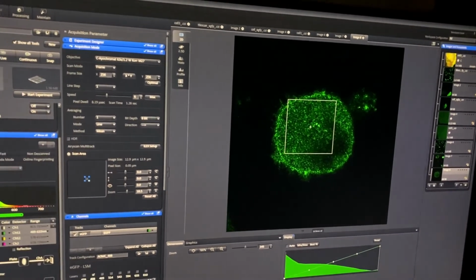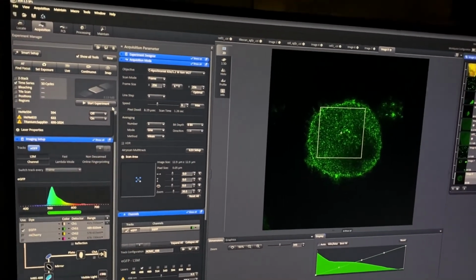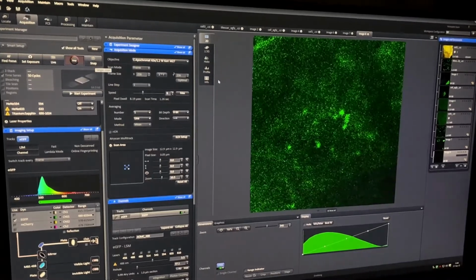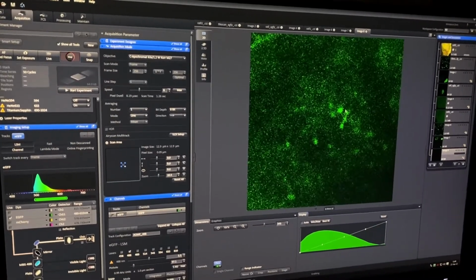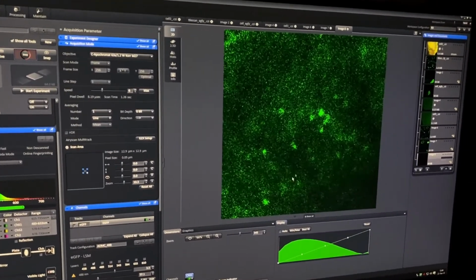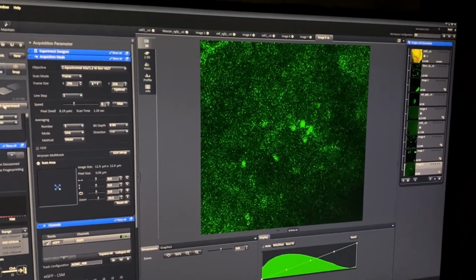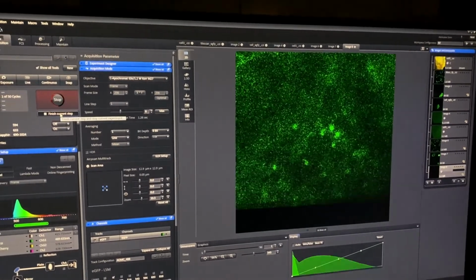And then I again record like 50 cycles for this. You press continuous to make sure it all looks fine. Yeah, now you can see that these higher order oligomers become a lot more prominent. Now I am just going to record for the next 50 cycles in this.